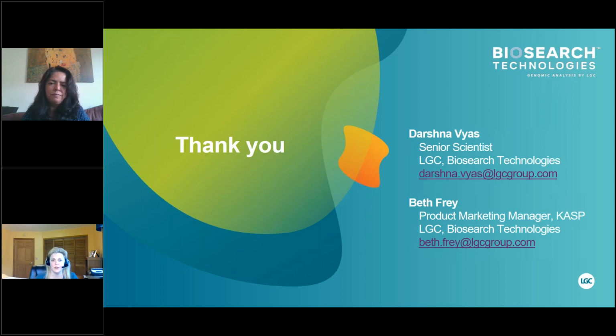Okay. And you mentioned KODs. It may be worth just reminding our audience what the difference is between a KBD and a KOD. So KBDs are basically submission of your SNP sequence, which can include variability in the flanking regions using the IUPAC codes, as I explained in the presentation. And they will go through our Kraken proprietary design software. And all it will do is take those sequences, design the KASP assays, and send you those assays as a design-only option.